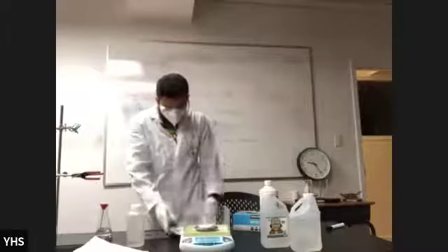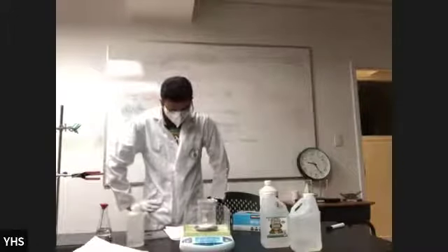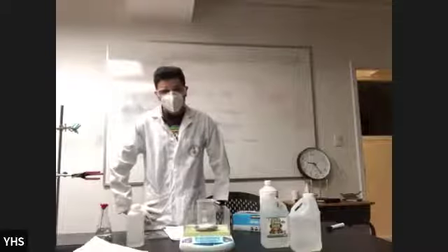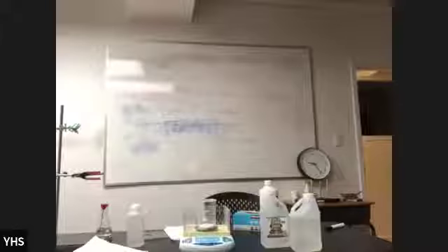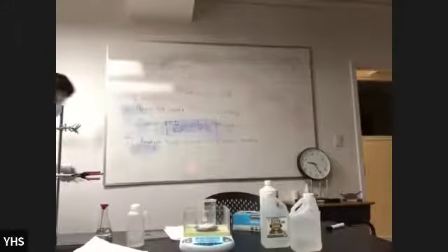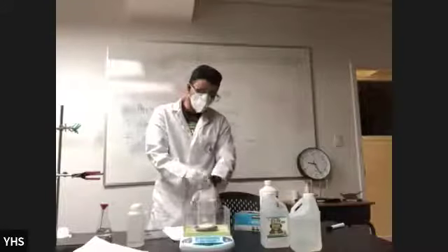Okay, what is the next step on my procedure? What is number 3? We just measured the temperature, right? What is number 4? Dissolve the solid baking soda in the solution, stirring with the thermometer. Okay, so our number 4, give me just a second, okay? I think we're good. So step number 4 is, say that again, dissolve the solid baking soda in the solution, stirring with the thermometer. All right, let's try it.